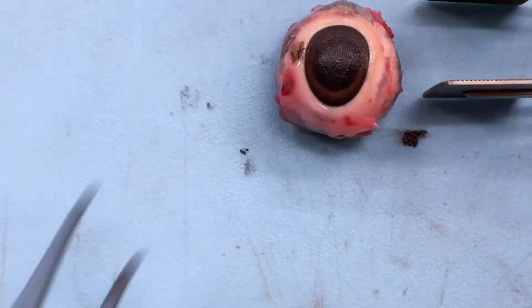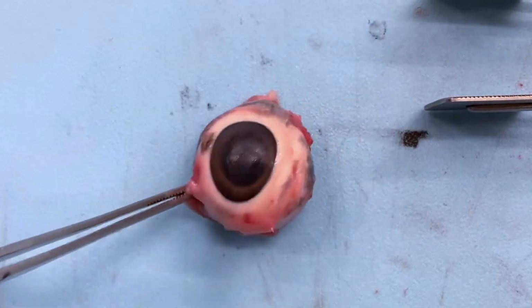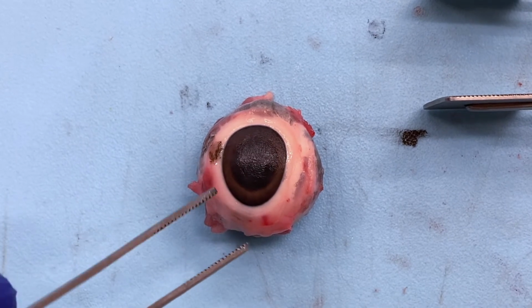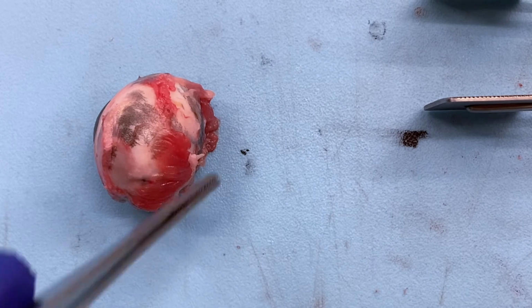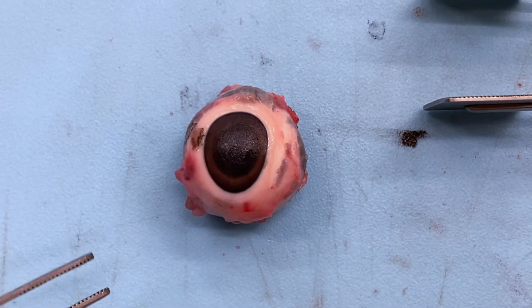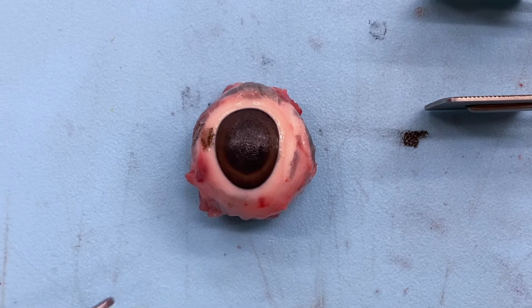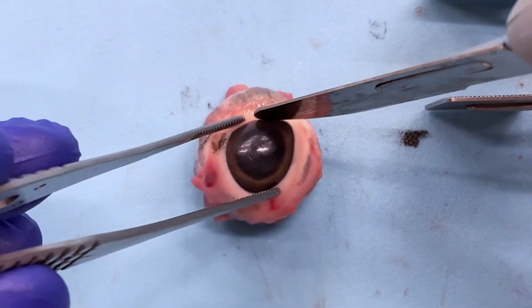All right, so now for the hardest part. Cutting into a globe, especially with a scalpel, is not easy. This thing is filled with aqueous fluid and vitreous fluid. Remember, the vitreous fluid is going to make up most of the vitreous compartment in the eye. The aqueous fluid is going to be in our front compartment here, the anterior compartment, where our cornea is. So I typically like to make some sort of incision initially in order to relieve that pressure. So let's go ahead and try to just do that.